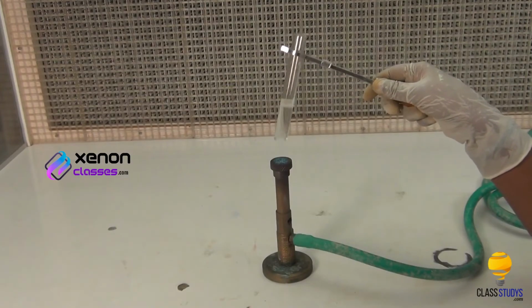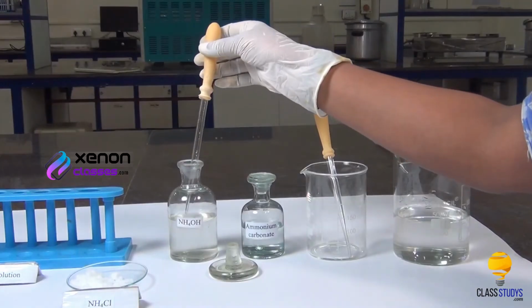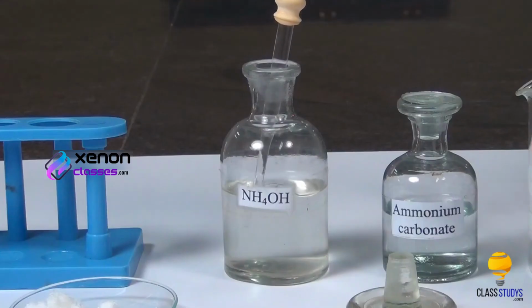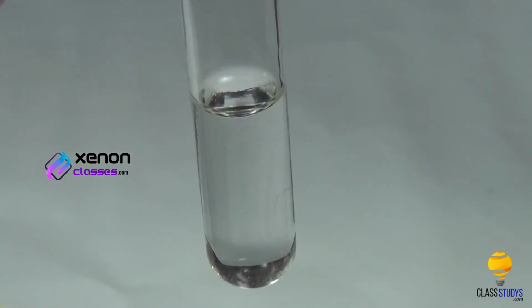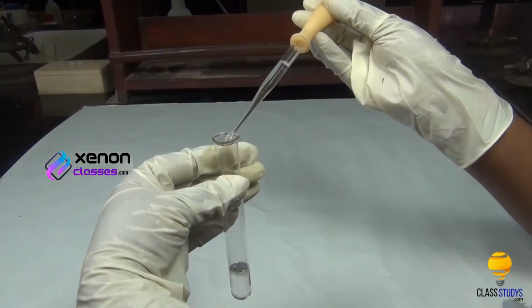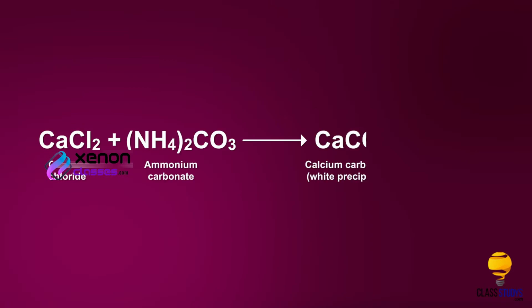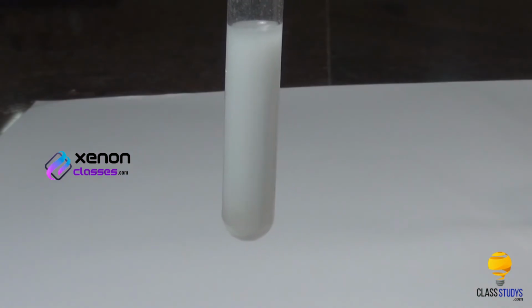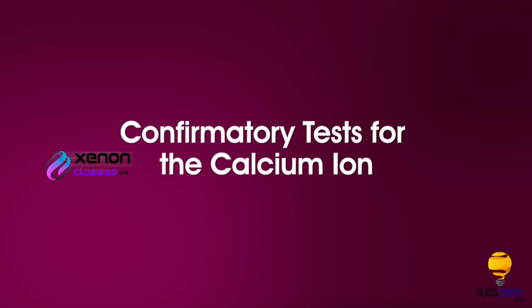Boil the contents of the test tube over the Bunsen burner and cool. Using a dropper, add ammonium hydroxide to the test tube till the solution smells of ammonia. To this, add ammonium carbonate solution using another dropper. Calcium ions in the solution react with ammonium carbonate to form a white precipitate of calcium carbonate. Finally, we look at the confirmatory tests for the calcium ion.